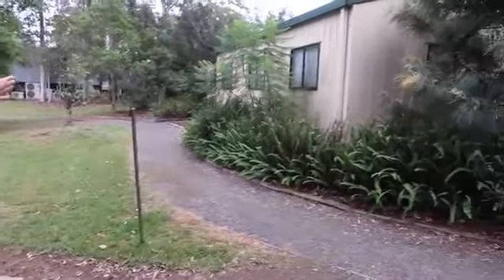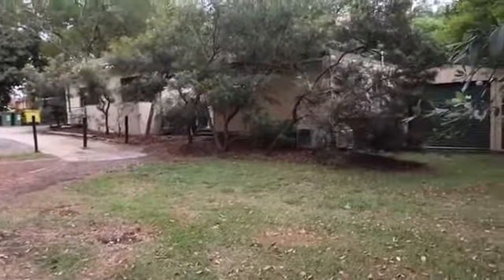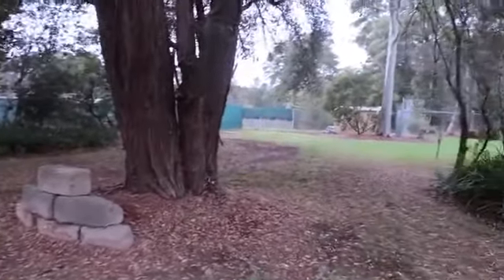Then we've got a shed over here where we do a lot of the cognition work. So at the moment we've got blueies and sleepy lizards in there, and then we have what we call the cognition center, but it's really just a complex of rooms where we do a lot of animal behavior work and also performance work. So we can measure sprint speed, endurance, temperature preference, and things like that.